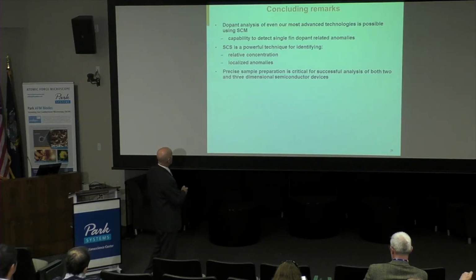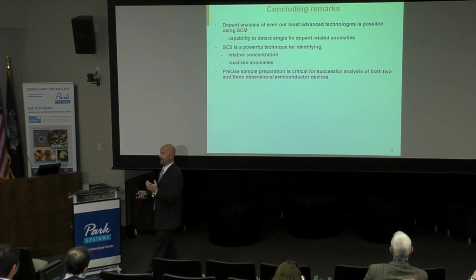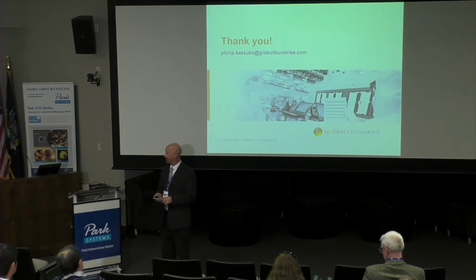But the one thing is precise sample preparation is necessary for successful analysis, especially at these technology nodes. And again, thank you for the opportunity to share my work with you.